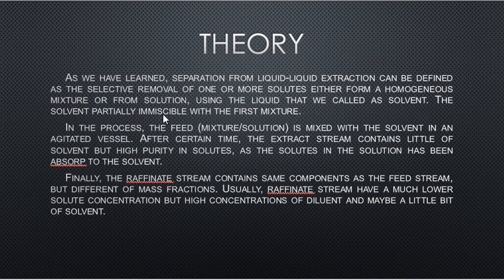The solvent is partially immiscible, or insoluble, with the first mixture, which is the feed. In the process, the feed mixture or solution is mixed with the solvent in an agitated vessel. After a certain time, the extract stream contains little solvent but high purity of solutes, as the solutes in the solution have been absorbed into, or extracted to, the solvent.